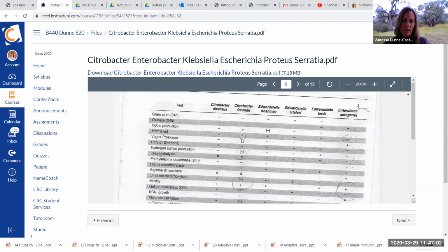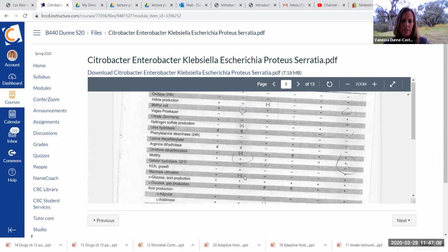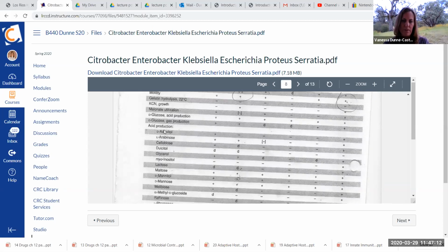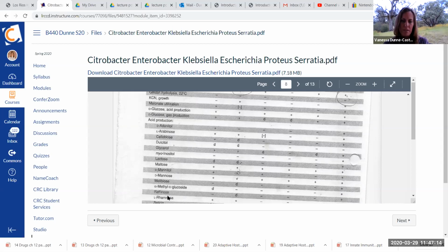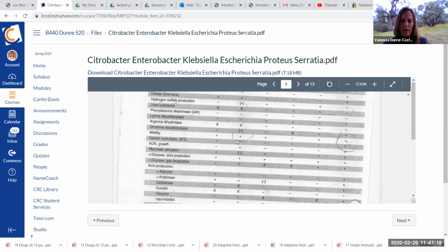So oxidase, methyl red, Voges-Proskauer, for example, are here, but there's a bunch of other stuff that you'll find that are pertinent for your chart. Here, anytime you see acid production, that means fermentation, so fermentation positive or negative. So a couple of things to note on this one, as you're taking this information and transferring it over to your own biochemical results chart, you really want to be cautious about anything that says D or anything that has a parentheses or these bars around them.